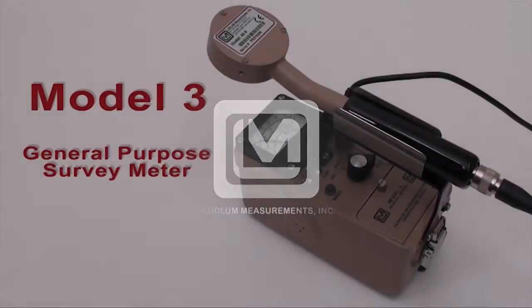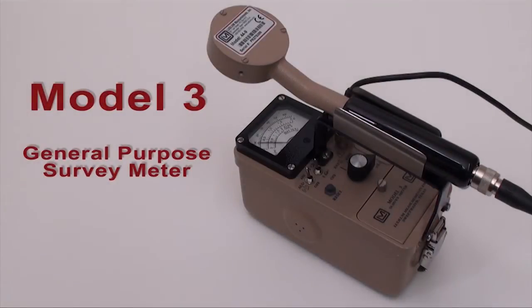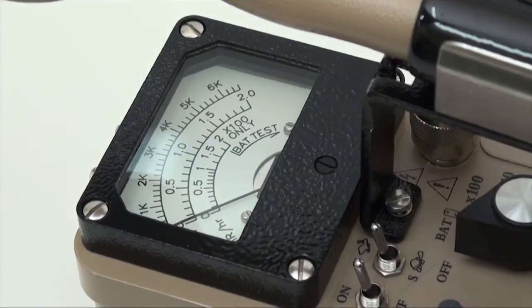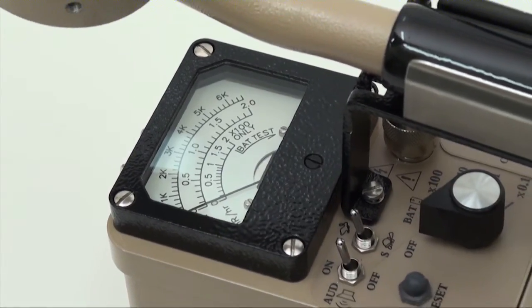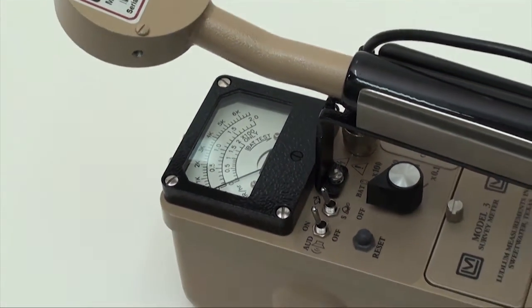The Model 3 is Ludlum's most popular general purpose radiation survey meter. This instrument displays the radiation rate from events sensed by an external detector connected via cable.